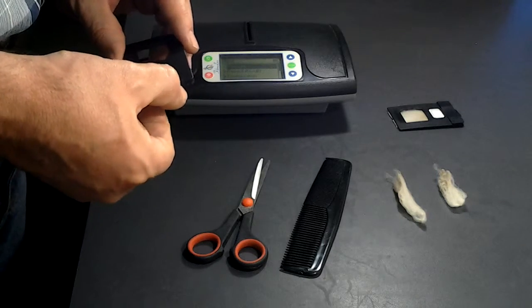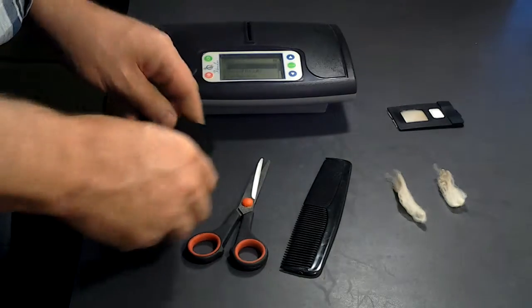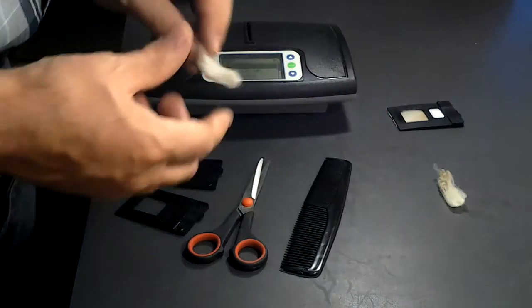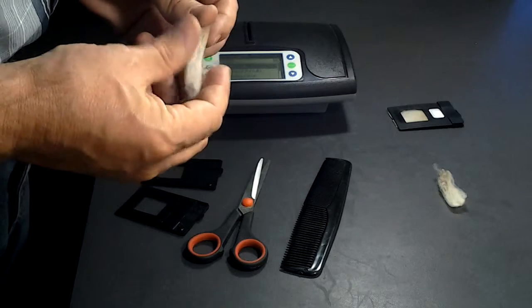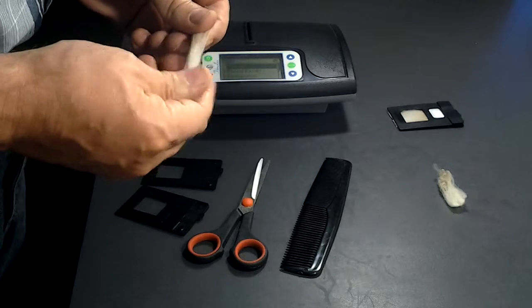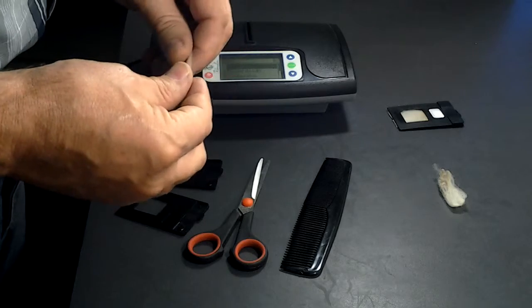First things first, open your sample holder. You need a small sample like this. For consistency, we recommend you always take it from the same place on the animal, the mid-side sample.